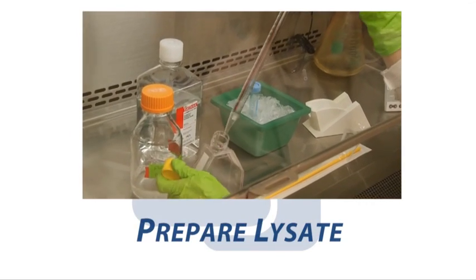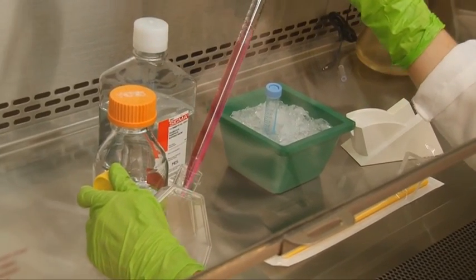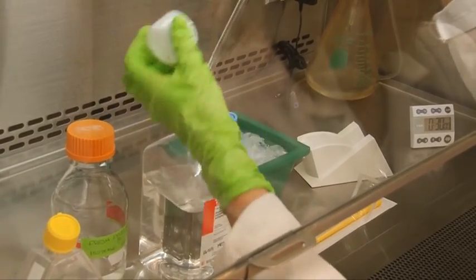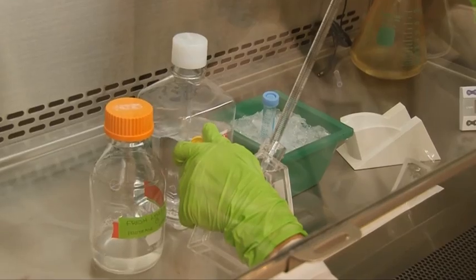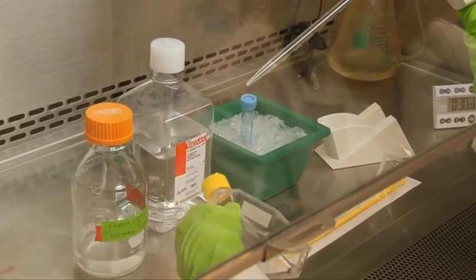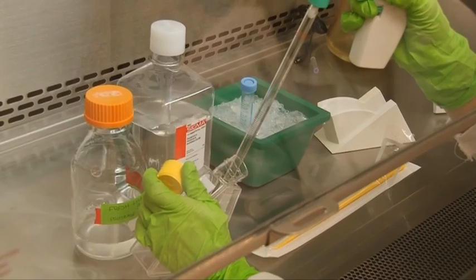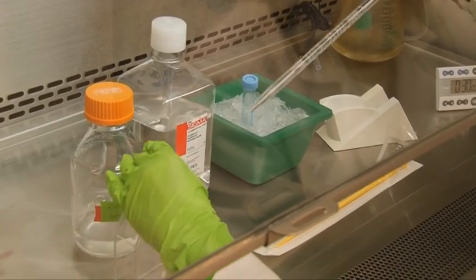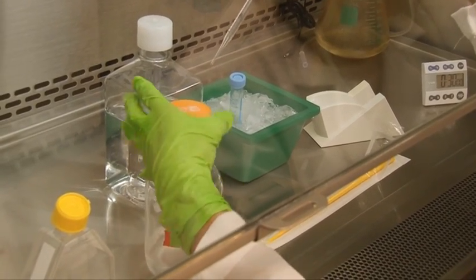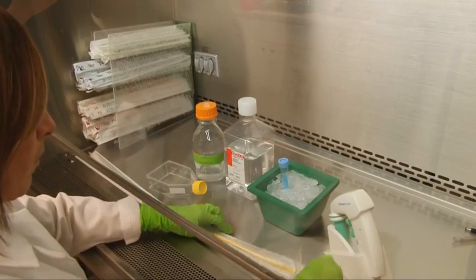Before we can start preparing the blot, we must first prepare our sample lysate. In this example, we'll prepare a protein lysate from cultured cells. Here, we wash the cells twice with ice-cold PBS and add enough lysis buffer to cover the cells. The choice of lysis buffer depends largely upon the localization of your protein of interest. We scrape the cells and transfer the cell solution to a centrifuge tube placed on ice.